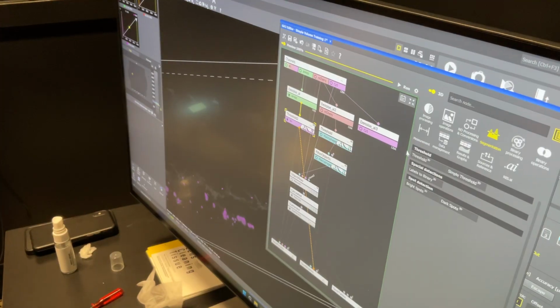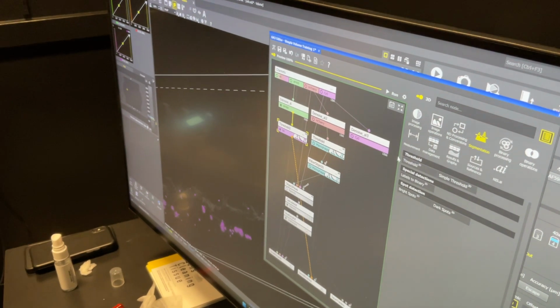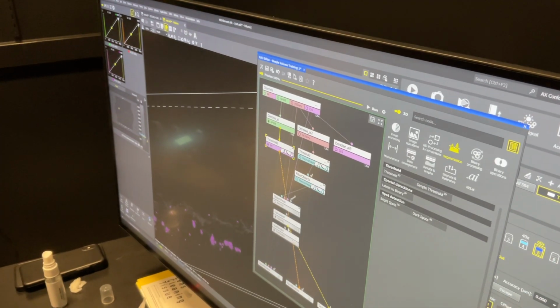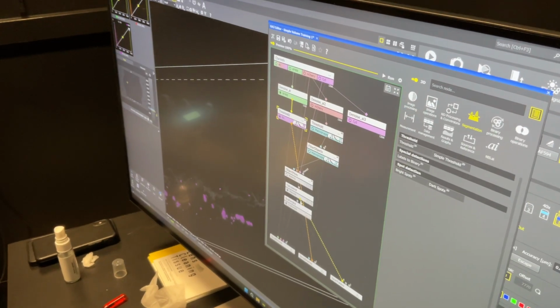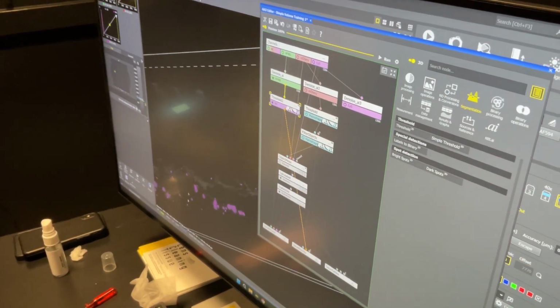They're maxed, so just filter out anything that's maxed out, because maybe it's a blob and you don't know if it's bigger or smaller. As a theoretical, I'm not saying that's what you want to do, just as a use case. Or you say, oh, that's too dim, filter that out. I'm having trouble filtering based on intensity in general, but once I get the shapes and I've cleared out my little stuff, then it's easy, just to showcase the flexibility.